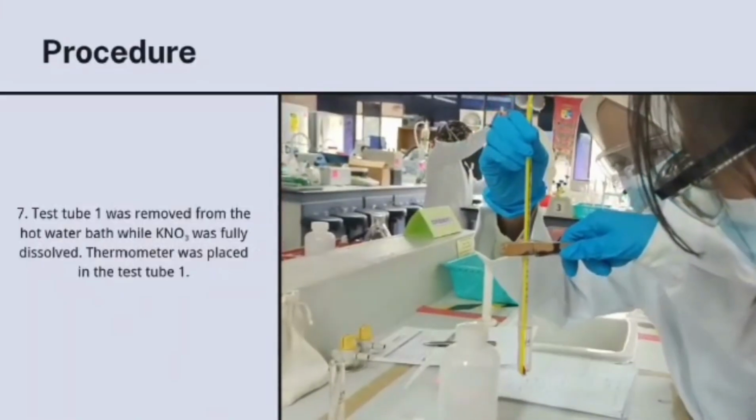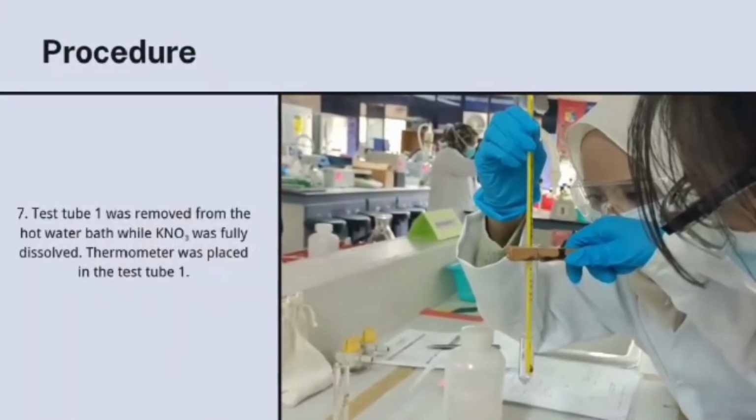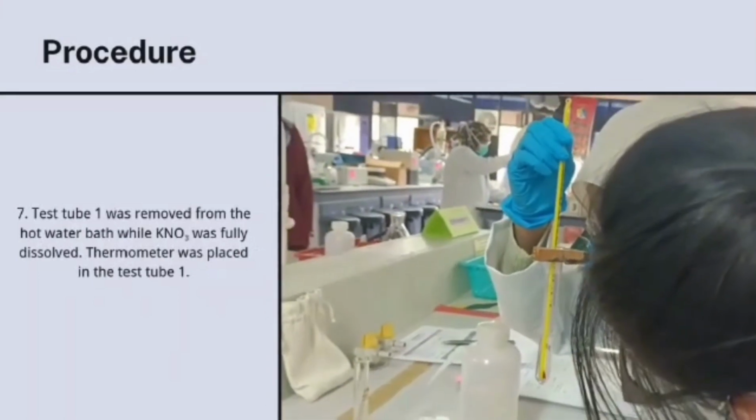Test tube 1 was removed from the hot water bath once the KNO3 was fully dissolved.